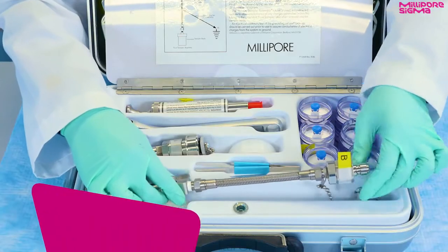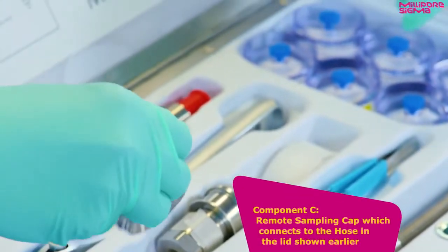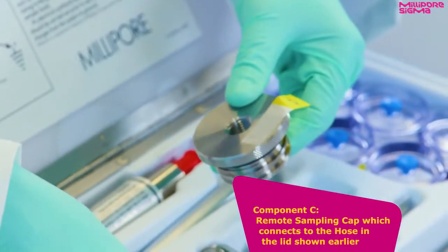Component B is the sampler assembly, which comes with its own cap. Component C is the remote sampling cap, which connects to the hose and the lid shown earlier.